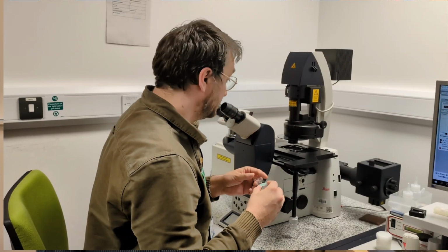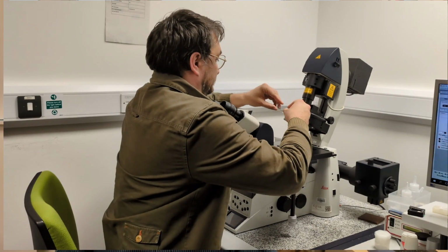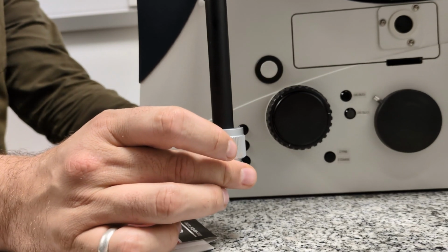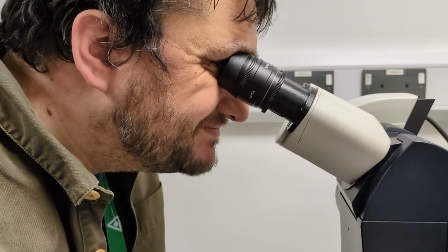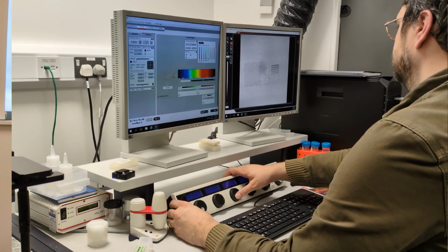Next, place the PSFcheck slide on the stage with the label facing towards the objective lens. Once centered on the polymer sample, patterns can be located using a 10x air objective in bright field illumination. Once illuminated, the patterns can be centered, focused and rotated using the microscope controls.